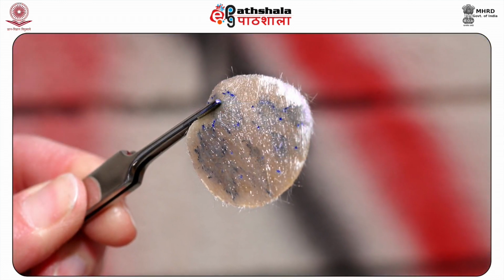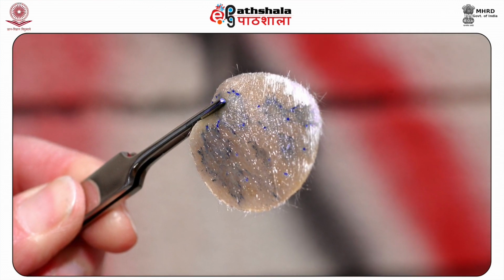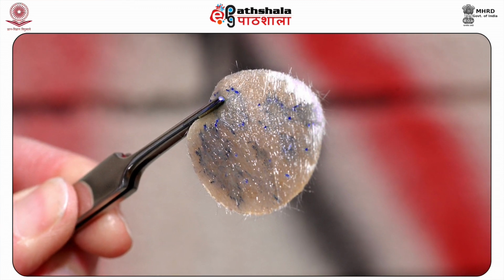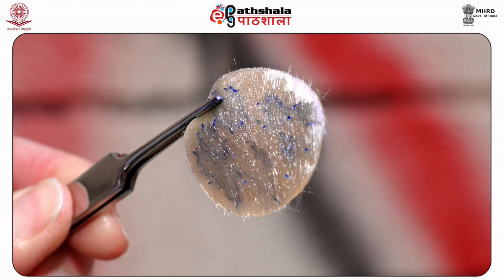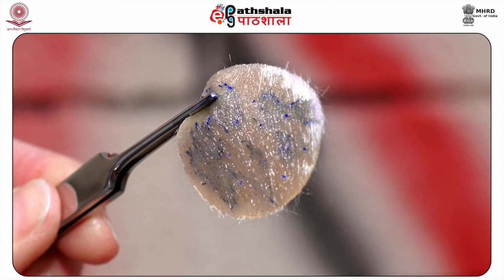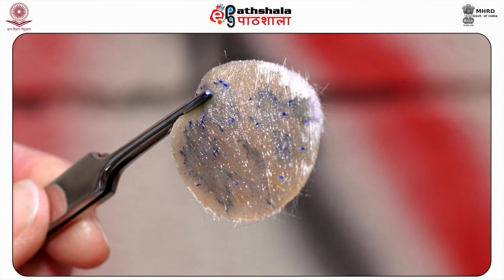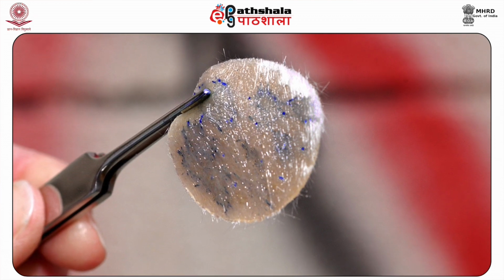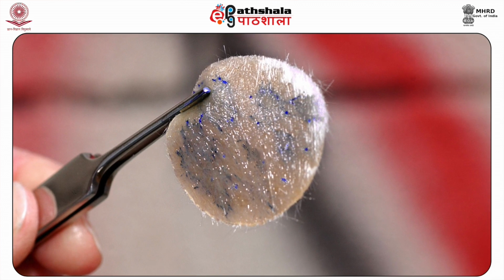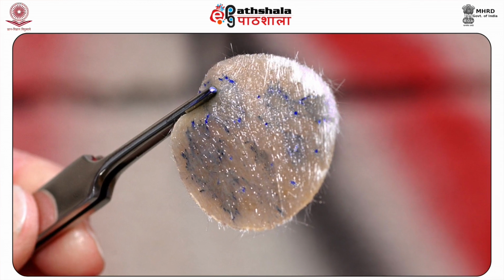The suspected element in GSR is taken in an atomizer, a graphite tube or tantalum strip, and is excited by heating. The radiation from a discharge tube with the suspected metal electrodes is passed through the atomizer. The loss of intensity in radiation gives the quantity of the metal in question. The technique is very useful and popular for the examination of GSR particles.